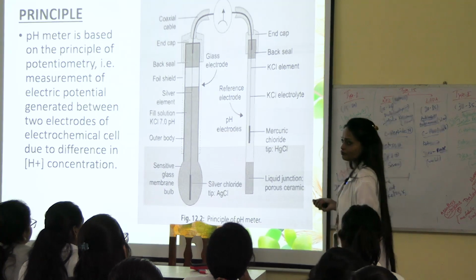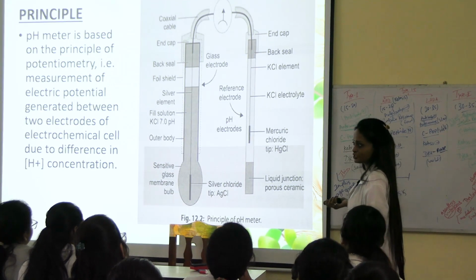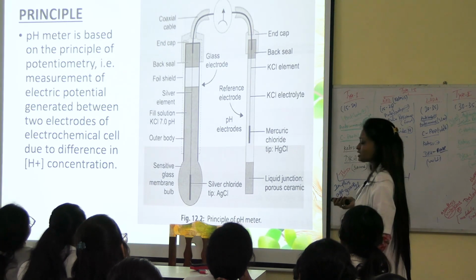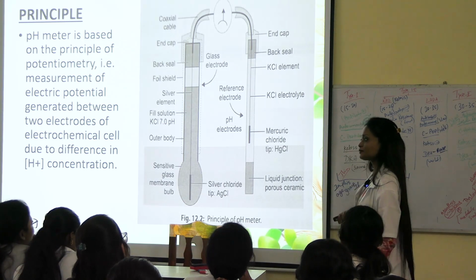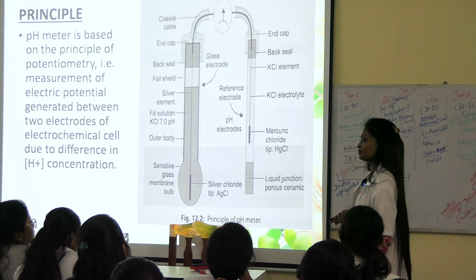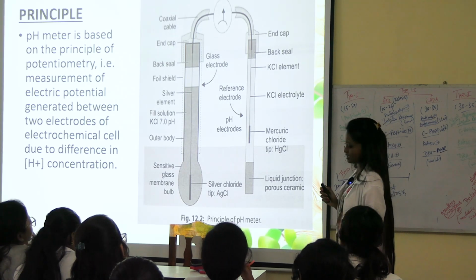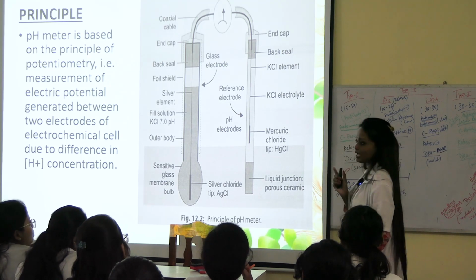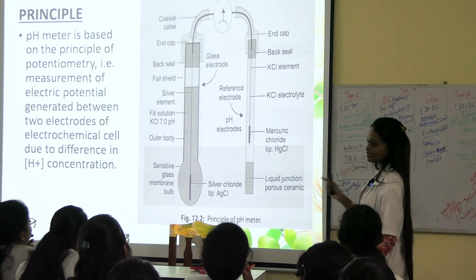So why is the pH 7? This is neutral pH. What does pH 7, neutral pH, mean? It's a salt. So pH 7 neutral means they have the same amount of hydrogen ion and the same amount of hydroxyl ion. So it neutralizes itself.